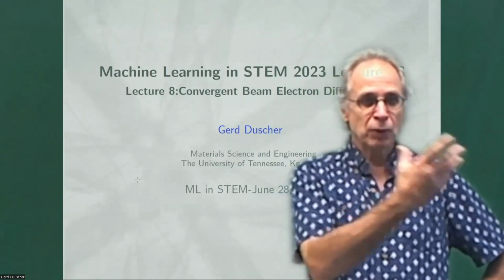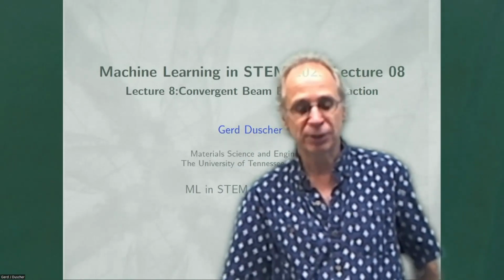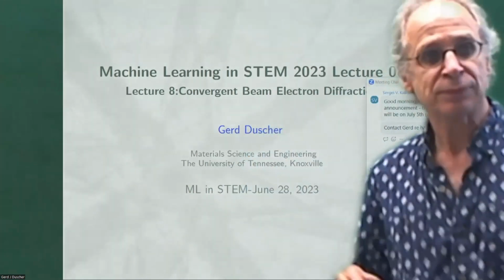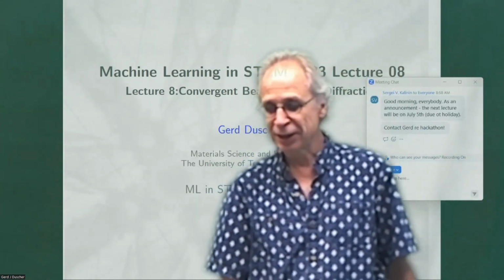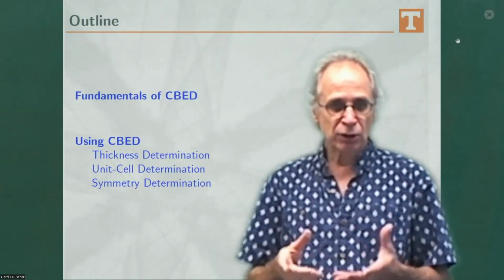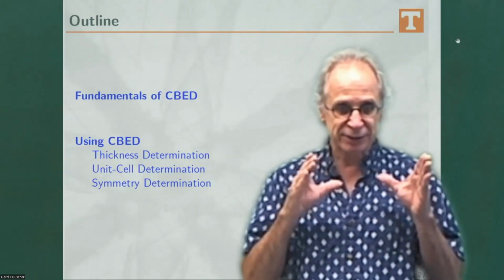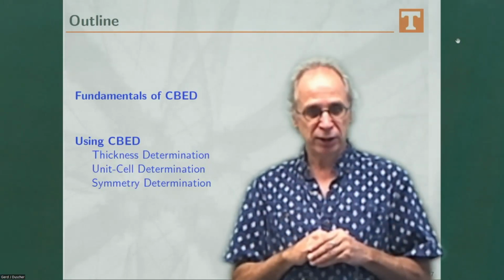So we started with imaging. So we did all the electron microscopy, except one very important method, and that is diffraction.